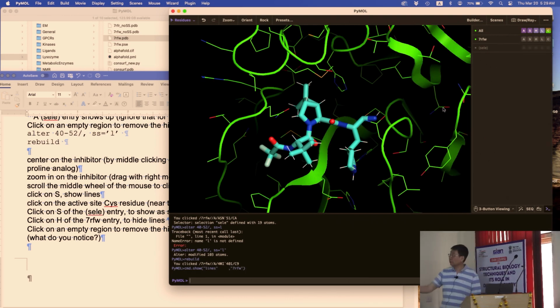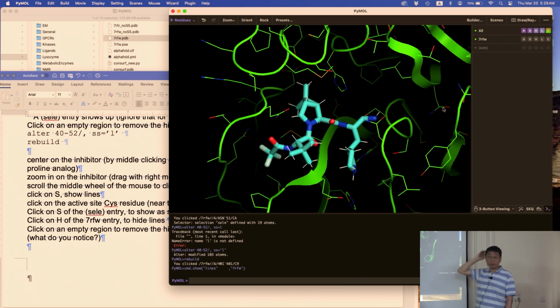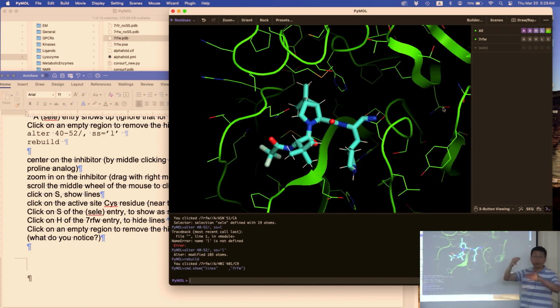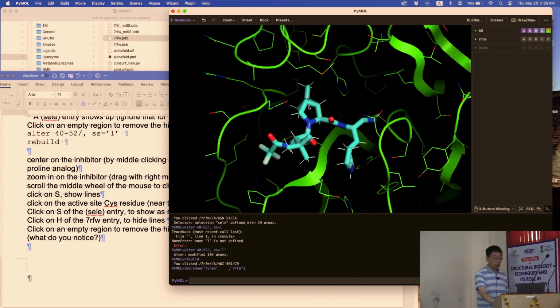So now you see everything that's around the inhibitor. Do you see that? I know it's very complicated. Bear with me for a second. Do you see the same thing? Okay. And so now to find out which one interacts, you just jiggle your view a little bit. You can sort of see where the inhibitor is sitting and what residue is close to it.